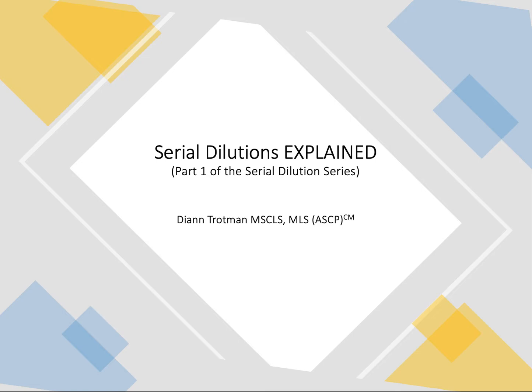Then part three will be a video of an actual serial dilution, performing one with test tubes and pipettes, etc. And then part four will be serial dilutions with titers. Okay, so this is part one, explaining serial dilutions.